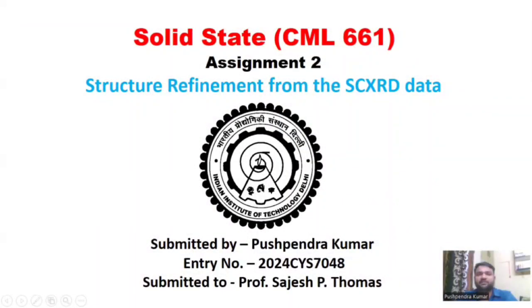Hello everyone, myself Pushpendra. Today I am presenting assignment 2 of Solid State CML 661. In this assignment, we will discuss structure refinement from single crystal XRD data.